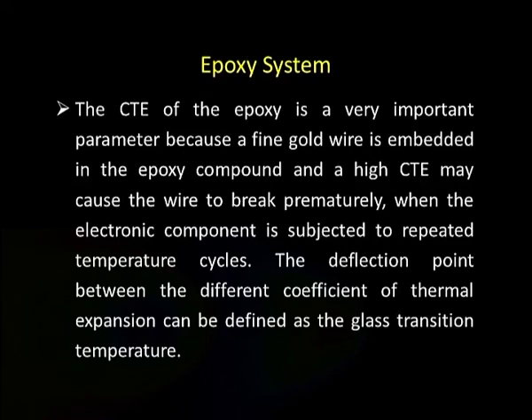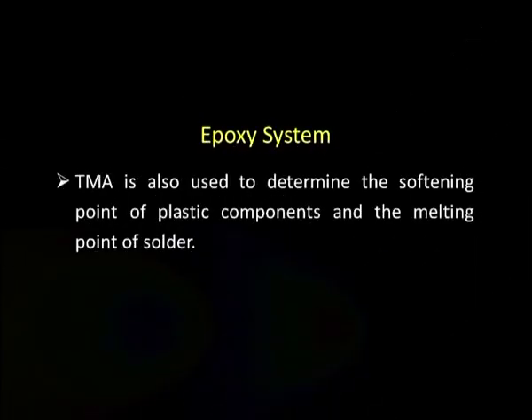The deflection point between the different coefficients of thermal expansion can be defined as the glass transition temperature. TMA is also used to determine the softening point of plastic components and the melting point of solder.